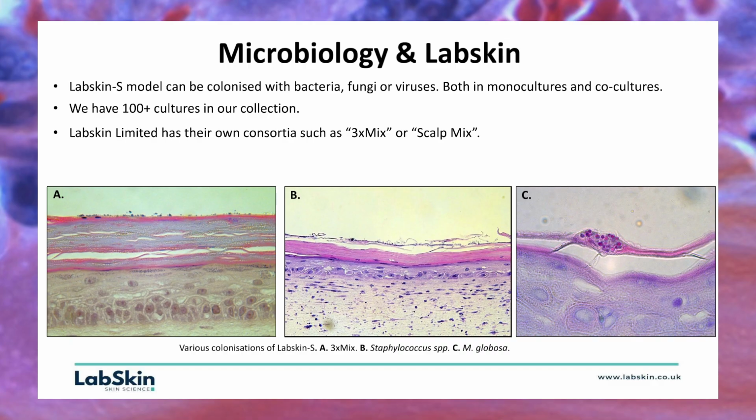We've created our own mixtures. We call one a 3X mix, which is a mixture of C. striatum, C. acnes and S. epidermidis. These are the top 3 microbes that make up everybody's microbiome, just in different ratios depending on who you are. And we also have a scalp mix, which is this 3 mix of skin microbes plus Malassezia. So this is the yeast or fungi that can cause dandruff.